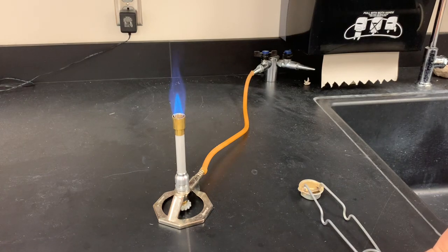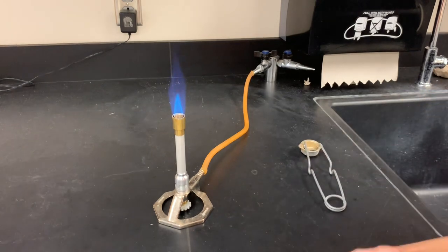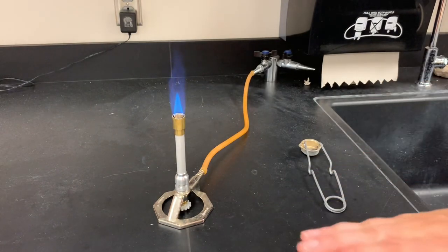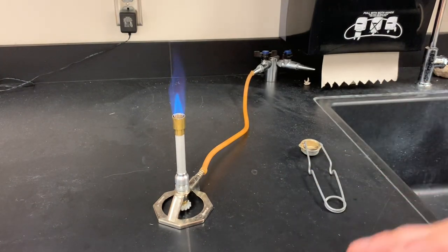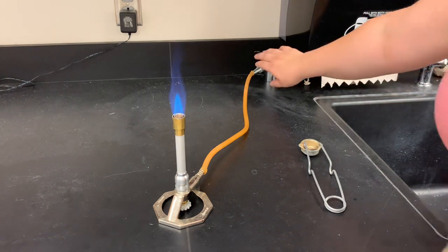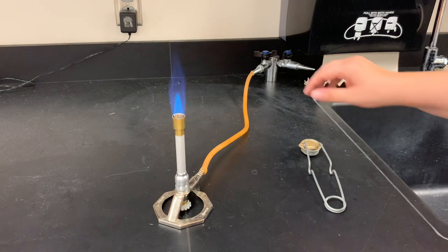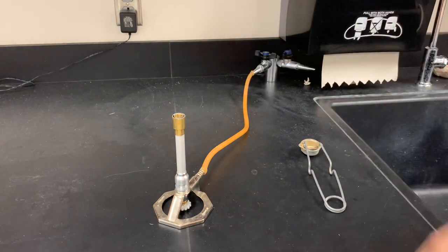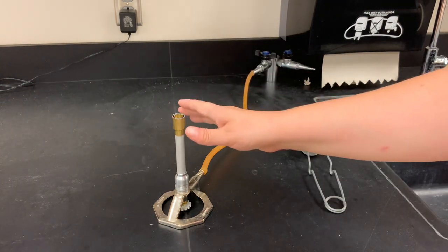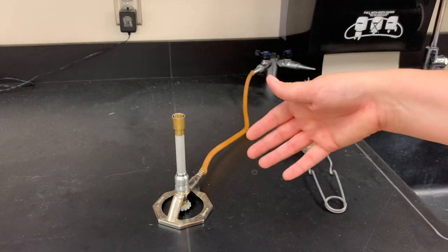Once your Bunsen burner is lit, make sure you don't walk away from it or leave it unattended. Make sure you have everything assembled before you light it. Should anything go wrong at any point, the first thing you always want to do is turn off the gas — push the valve away from you. When you're done with your lab, push the valve away from you to turn the gas off. The burner will be hot metal, so don't touch it right after use.